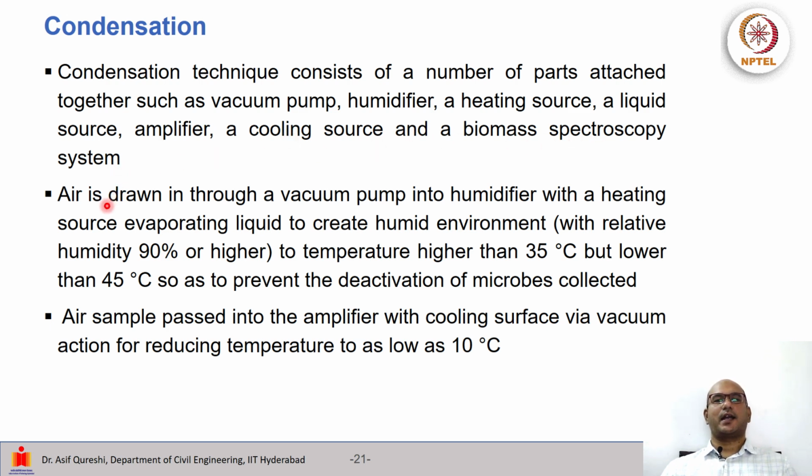In this mechanism, air is drawn in through a vacuum pump into a humidifier with a heating source evaporating the liquid to create a humid environment. The relative humidity could be 90% or even higher, and the temperature higher than 35 Celsius but lower than 45, so that the heating happens but the microbes are not deactivated. So this kind of temperature is maintained.